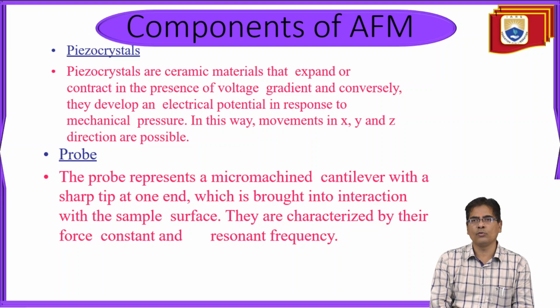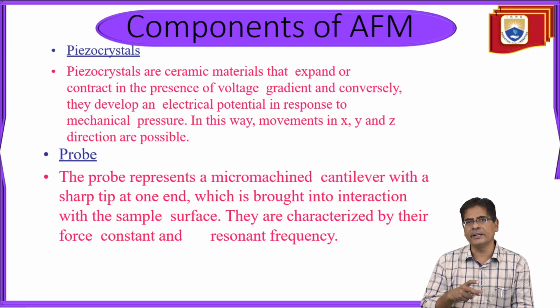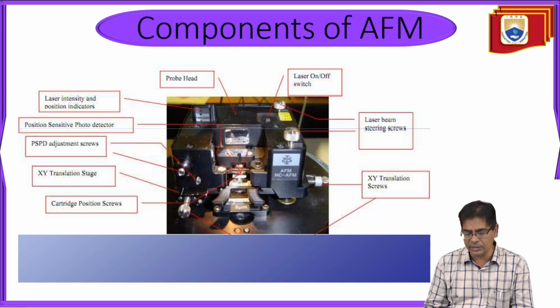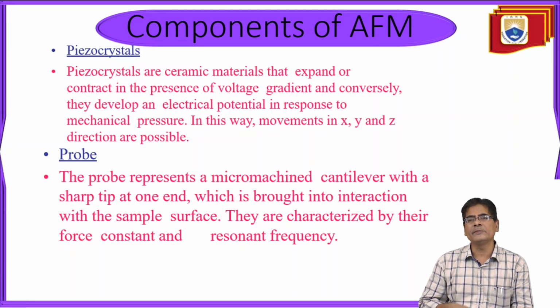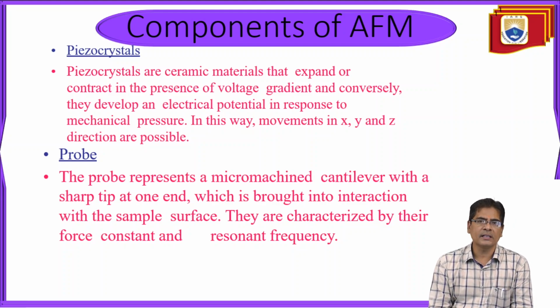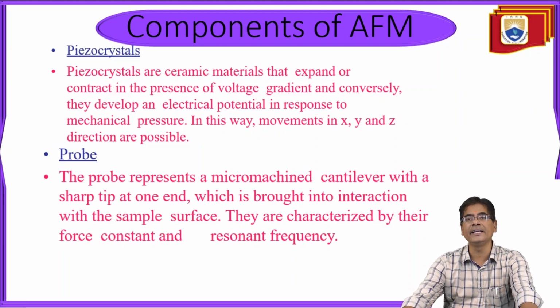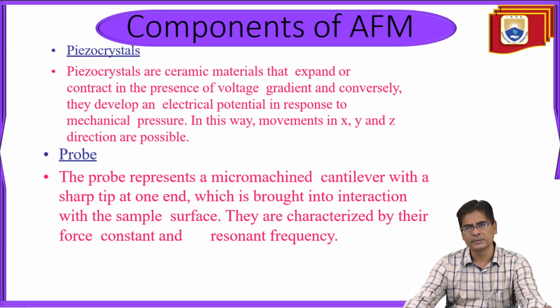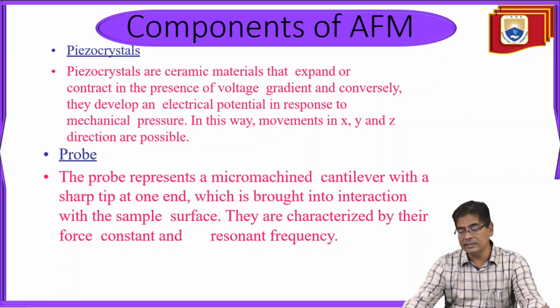To achieve those particular translations, we go for some crystalline methods. One of the crystals is a piezoelectric crystal. These piezoelectric crystals are ceramic materials that expand or contract in the presence of a voltage gradient, and conversely they develop an electric potential in response to mechanical pressure. So in this way, movements along the three dimensions X, Y, Z directions are possible.